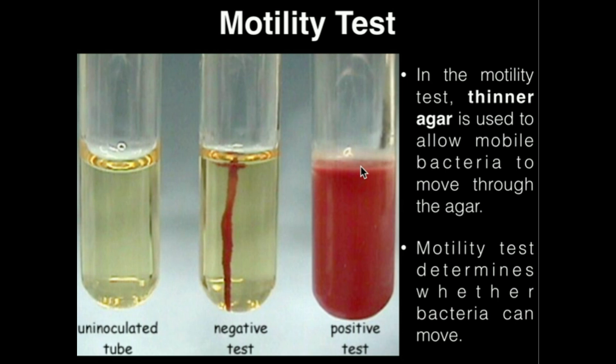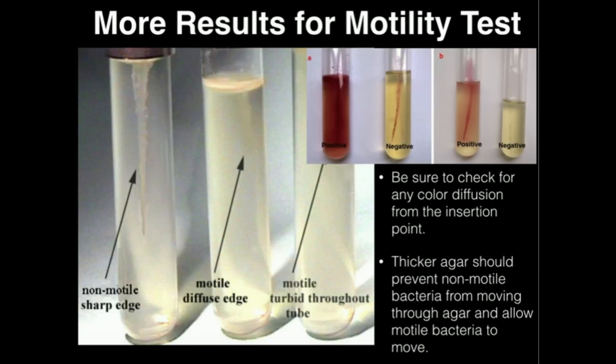The reason we have this red color throughout the tube is because the bacteria propagated — they were motile, so they moved throughout the tube. This agar also contains TTC, so the bacteria everywhere in the tube were able to use TTC as an electron acceptor, giving it electrons, causing it to turn red. That's the basis behind the motility test.